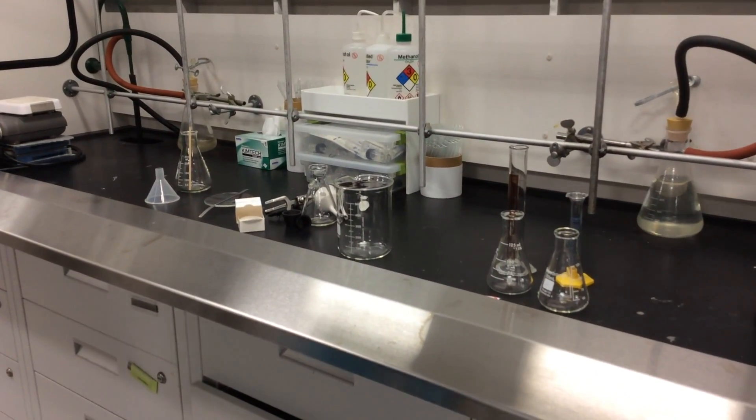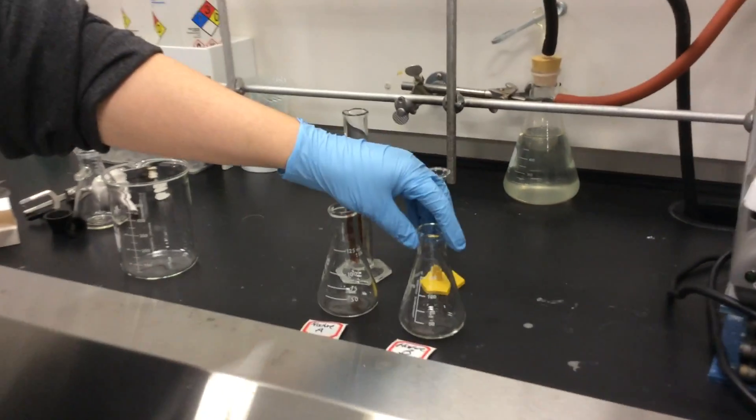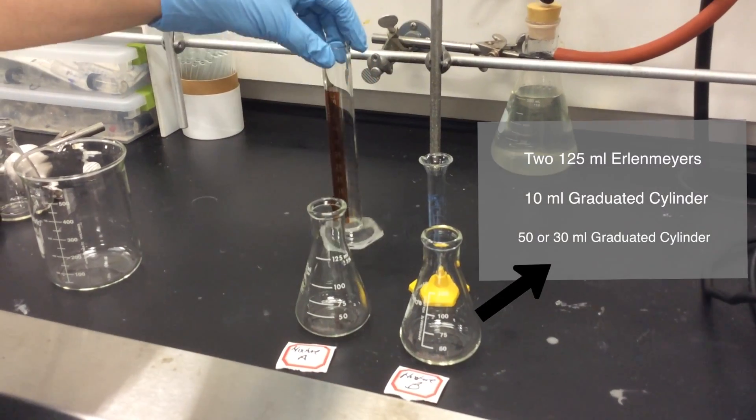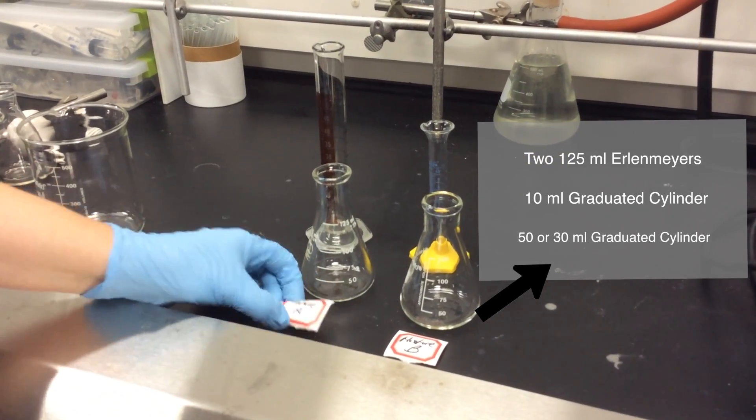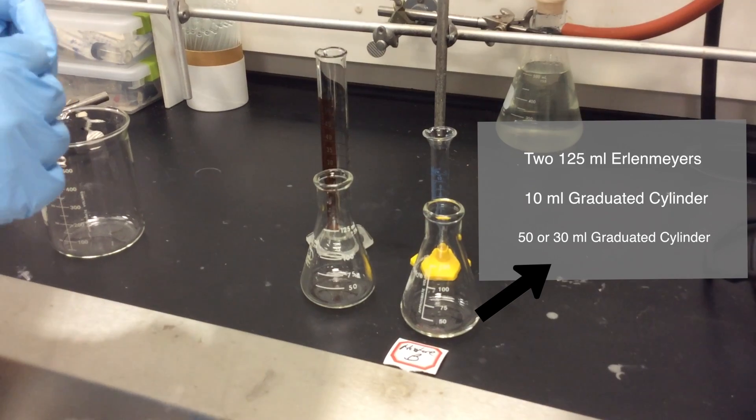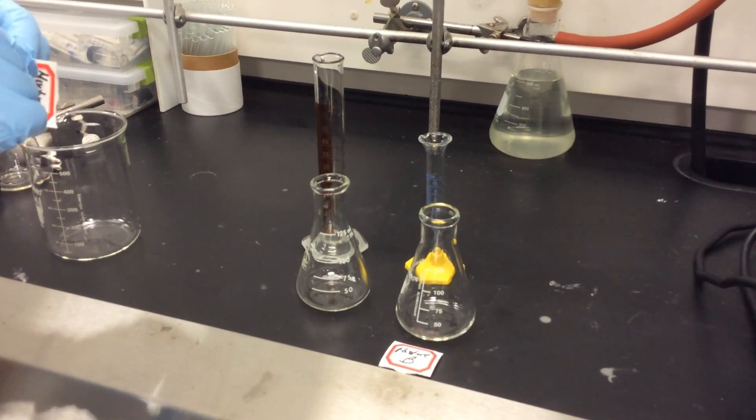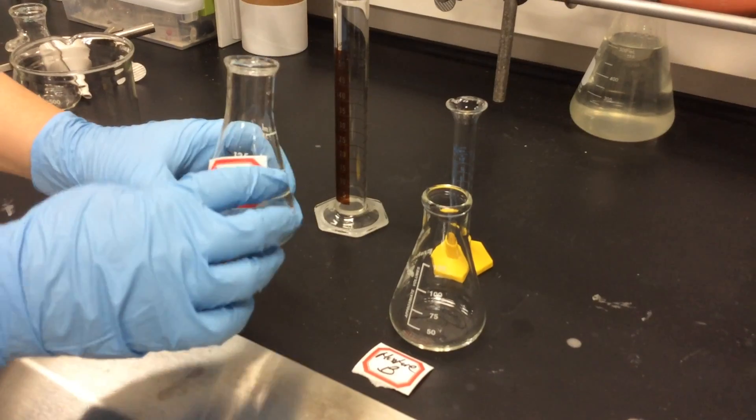All your glassware is located in your organic drawer under the hood. For this experiment, you'll first need two 125 milliliter Erlenmeyer flasks, a 10 and a 50 milliliter graduated cylinder. You will need to label the first Erlenmeyer mixture A, and the second Erlenmeyer mixture B.